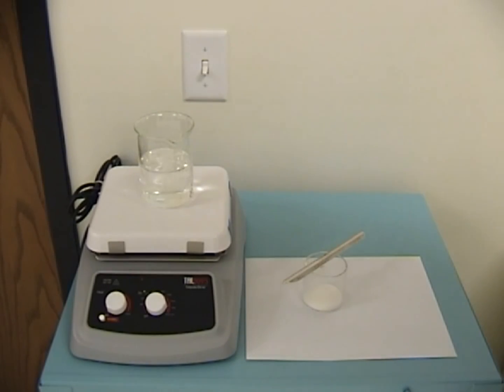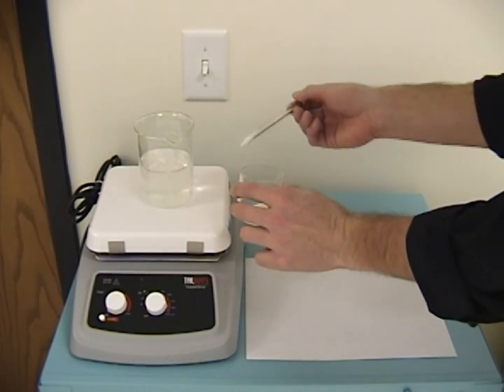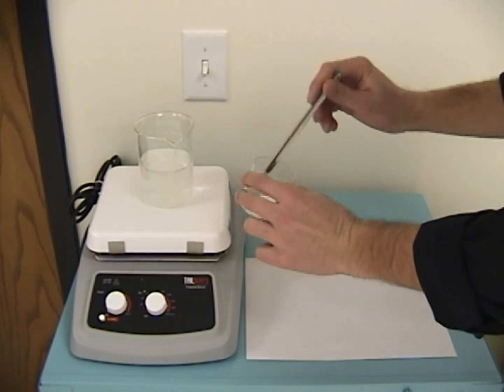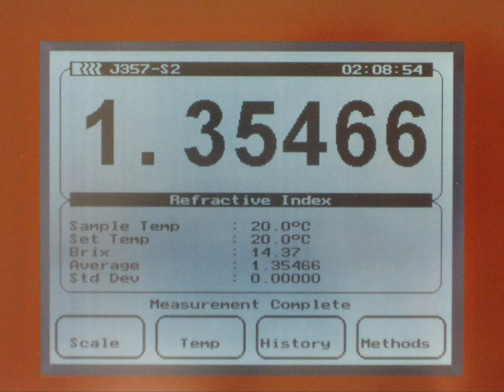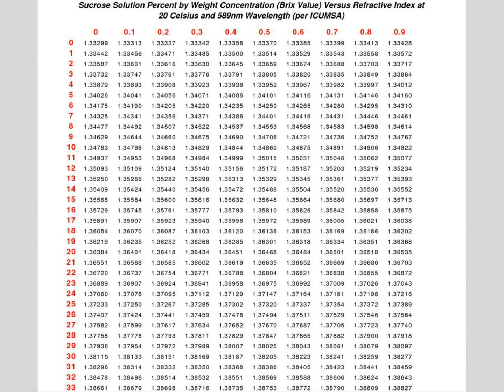The refractometer can also be set to give us the value of the degrees BRICS directly. To demonstrate this, we prepared an unknown sample of sugar and distilled water and performed a test. We can see here on the readout that the index of refraction is 1.35466. The instrument also tells us that the solution is 14.37 degrees BRICS. Cross-referencing with the table, we see that the measured index of refraction corresponds to a BRICS measurement between 14.3 and 14.4, consistent with our results. So not only can we determine the index of refraction of a given substance, but we can directly find the sugar content in a common measurement scale of a solution with an unknown concentration.